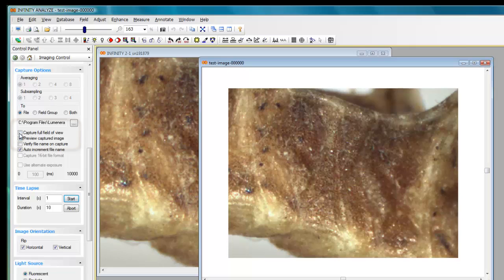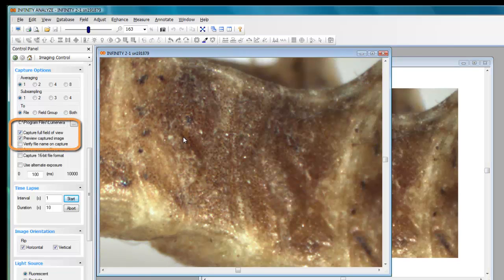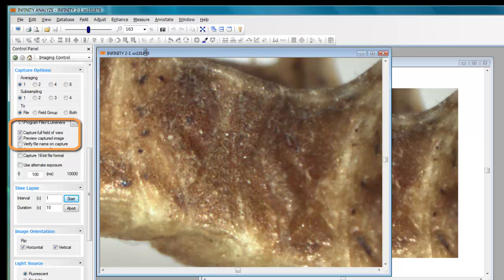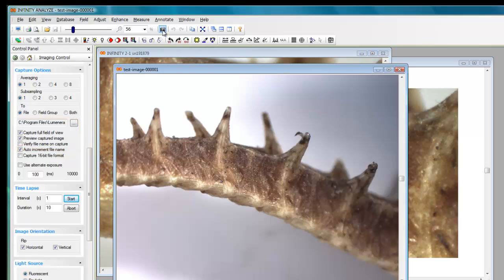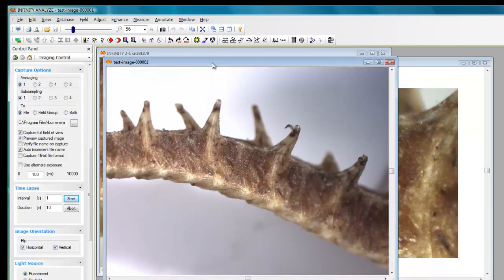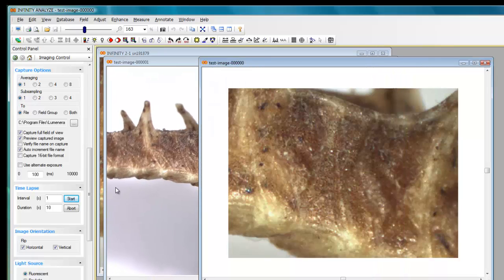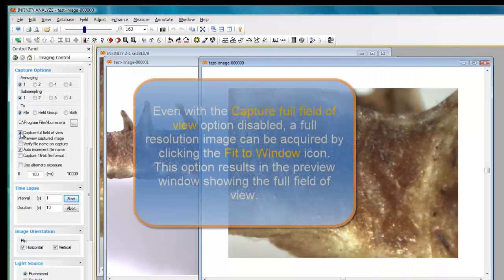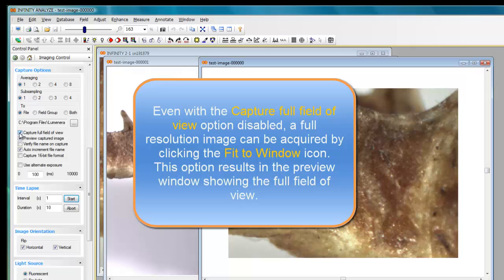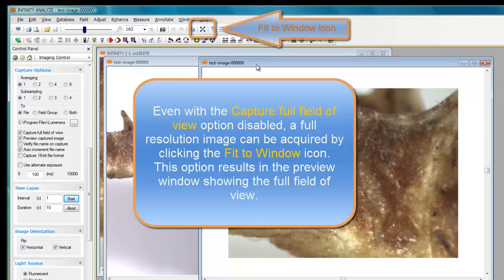Whereas, when I click the capture full field of view option, even though my live preview is only showing a portion of the image, when I click the capture button, in this case I'm getting the entire field of view. So that explains how the capture full field of view works and I've got the preview captured image checked, so therefore both of these images when I acquired them appeared on the screen.